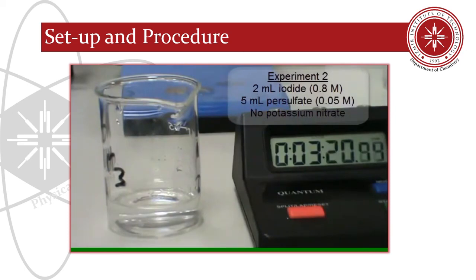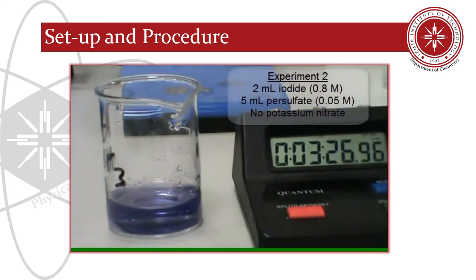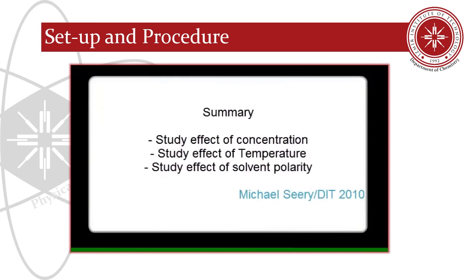Therefore if we remove our ionic solution, we can see here the time taken is much longer. It was 1 minute 50 with the ionic solution present. Here now it's about 3 minutes 27 seconds. So the ionic solution helps the reactants react faster and our rate is faster.